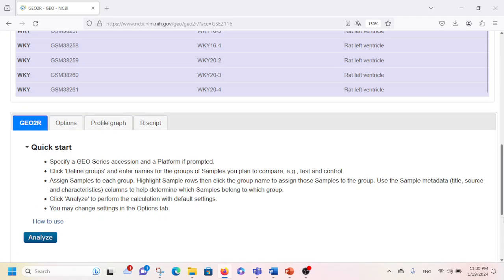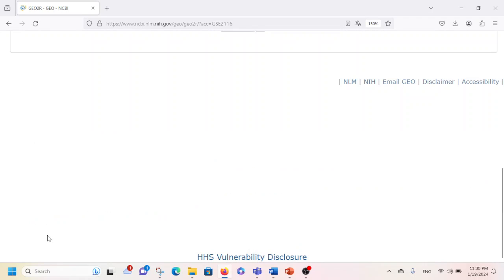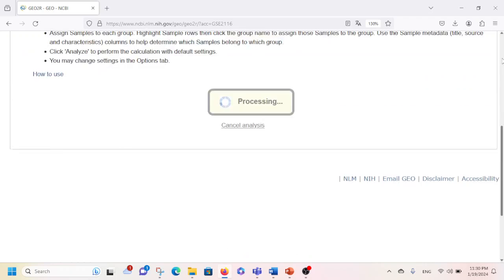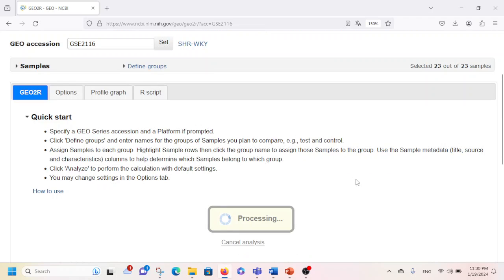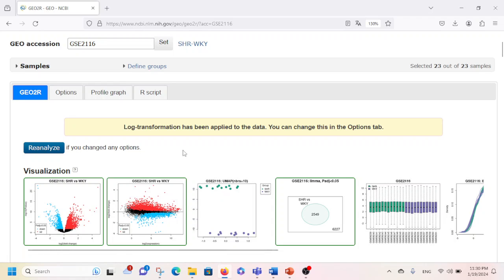Now I'm going to scroll down and click on Analyze. After clicking that it will take some time for processing, and soon we will see the graphs popping up. Now you can see that different types of graphs have popped up, so I'm going to click on each of those and describe what they mean.